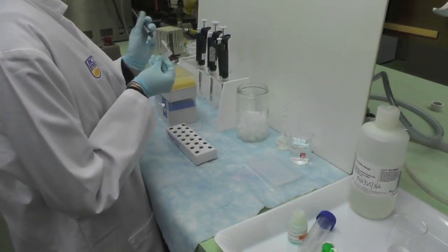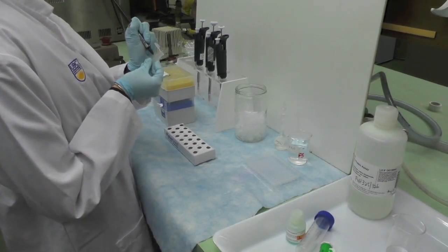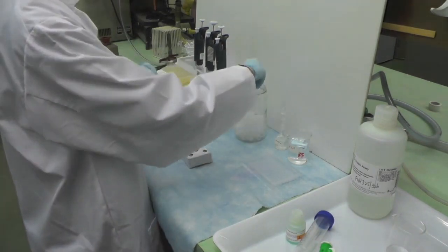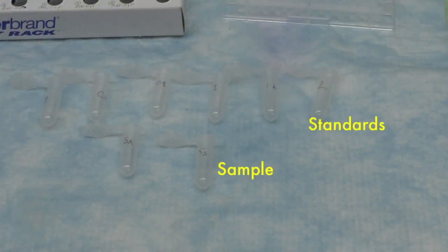Label the microfuge tubes before you start. You will need to dilute your samples to at least two different concentrations to ensure one of them will fall within the standard curve.